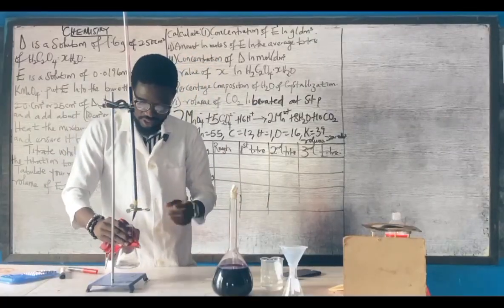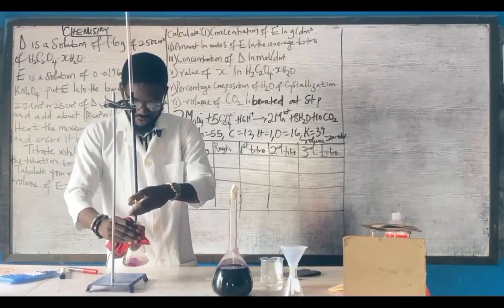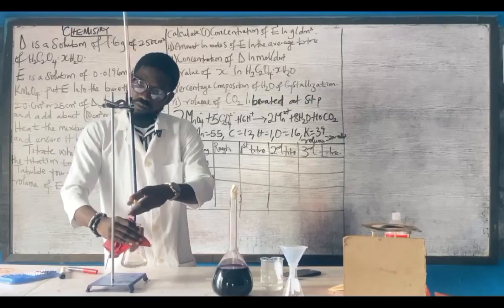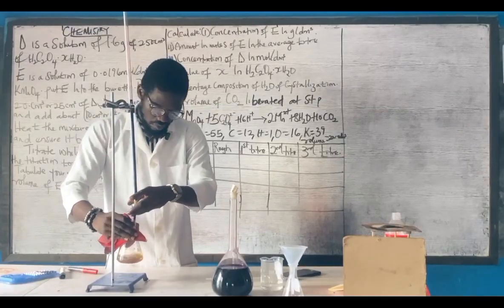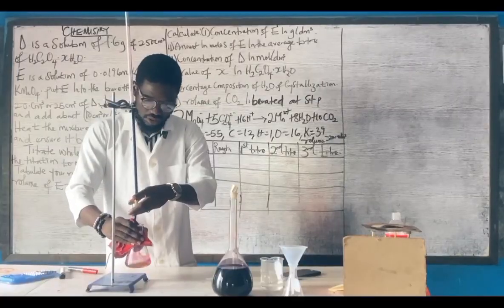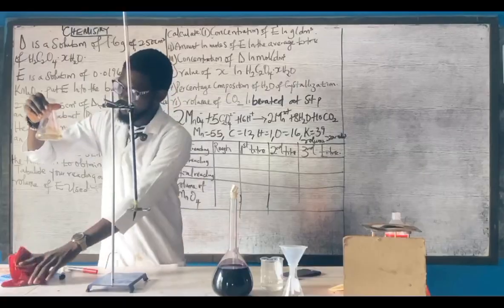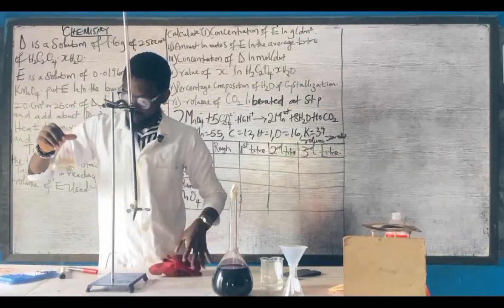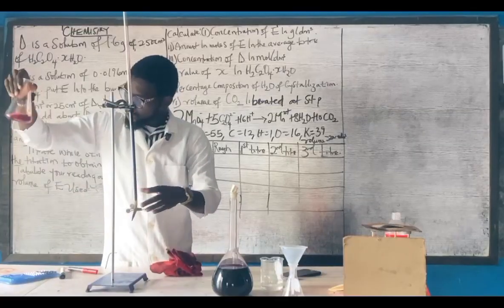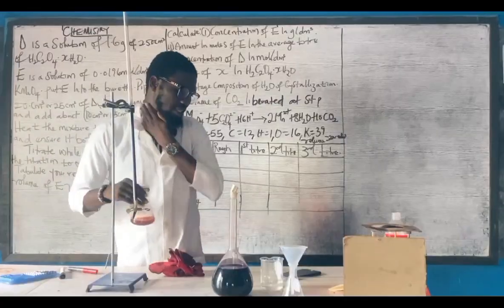We are not having it yet. I think we are getting there a little. So we're having a slight pink here. That is the main thing.